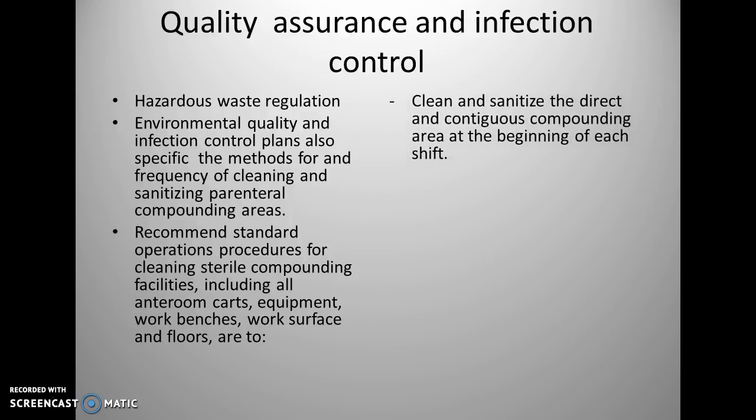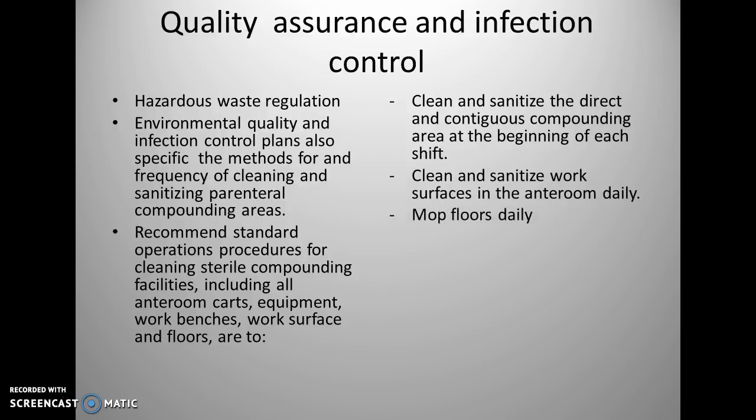And then clean and sanitize the direct and contiguous compounding area at the beginning of each shift. So even before the compounding begins, everything needs to be washed down every day. Okay, so clean and sanitize the work areas every day.